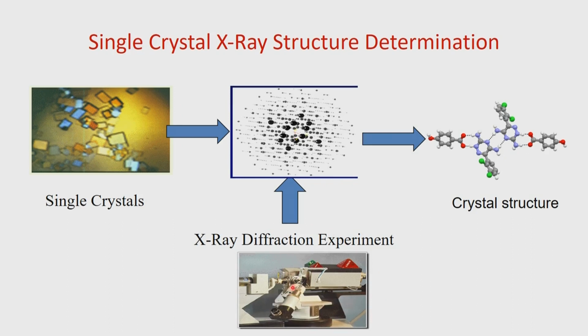The moving part is the goniometer. The goniometer is mounted along what we call the omega axis, and on that omega axis the crystal can rotate, and therefore we identify the position of the reflection in terms of 4 circles. The circles are the rotation about the crystal itself, which is the phi rotation, the rotation of the 2 theta arm, that is theta. So, we have phi, theta, and then this is the angle which the goniometer forces itself to go, that is the kappa angle, and then the base plate rotation is the omega. So, we have phi, omega, kappa and 2 theta. These are the 4 angles, and that is why it is called a 4 circle automatic diffractometer.